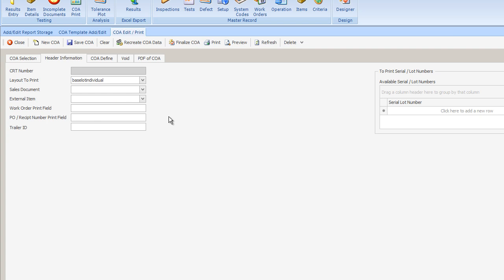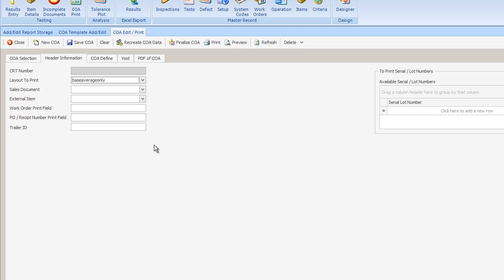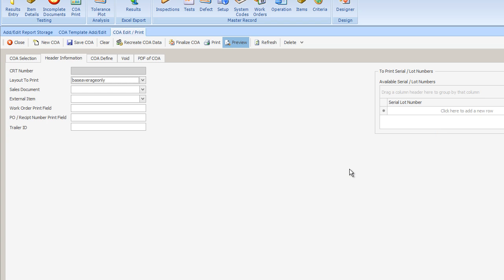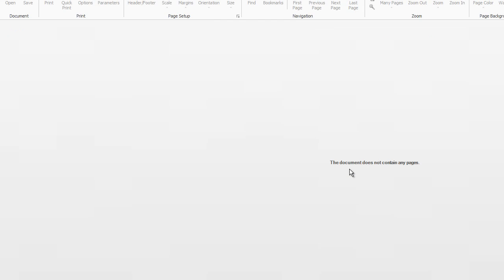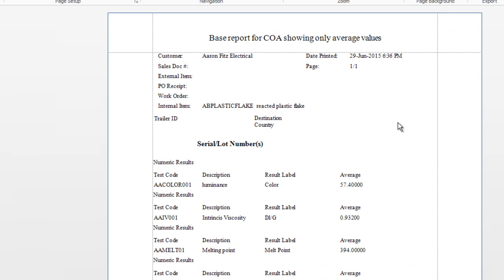But perhaps they don't want to see the individual lot information. Perhaps what the customer wants to see is the combined information. So we'll use the average report. When we select Preview and save it, we're going to have the opportunity to see another version of the report where the results across all of the color, IV, melt or moisture have been averaged. Again, this is just another generic report that the customer can add their own graphics to and their own boilerplate.